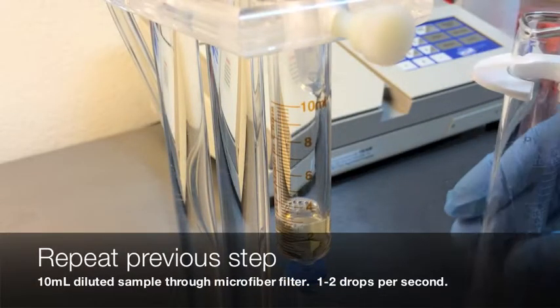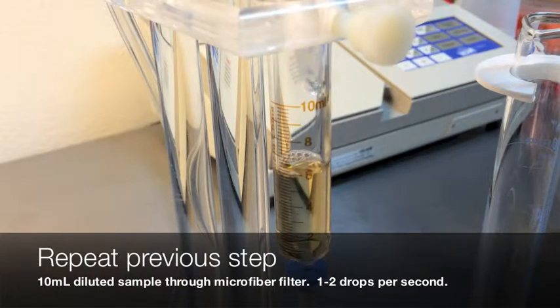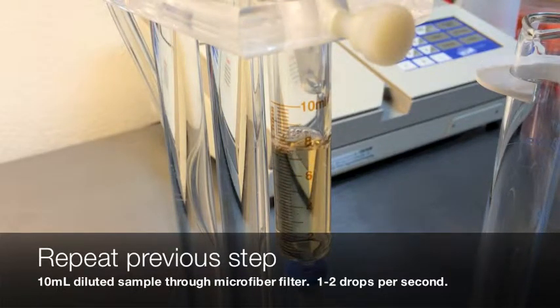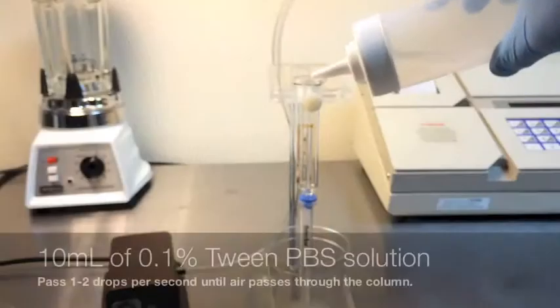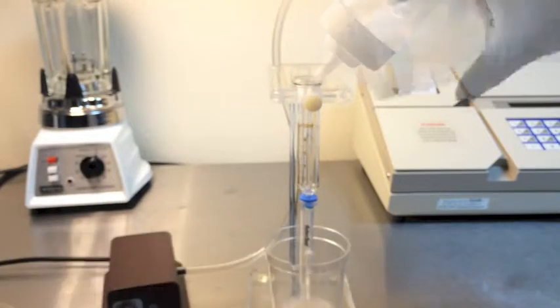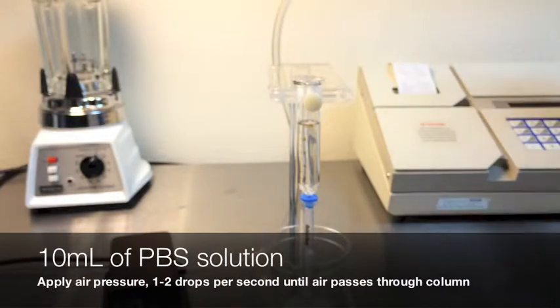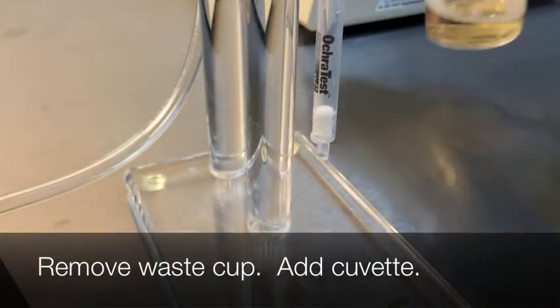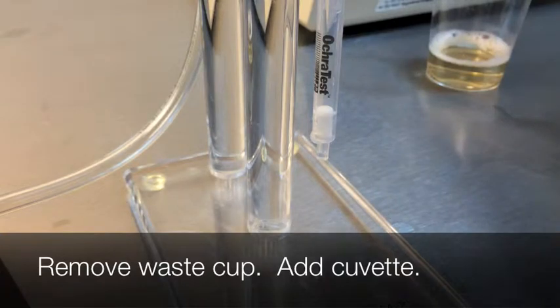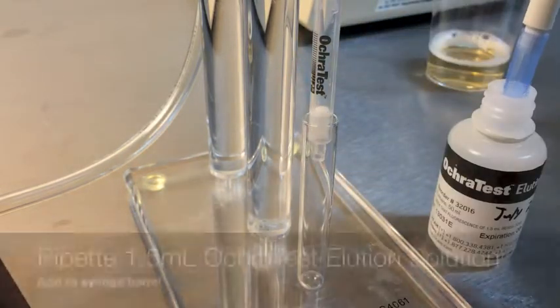Repeat the previous step. Add an additional 10 milliliters of filtered sample to the column and pass 1 to 2 drops per second until air passes through the column. Then wash the column a second time with 10 milliliters of PBS solution, passing 1 to 2 drops per second until air passes through. Remove the waste collection cup and replace with a clean new cuvette.